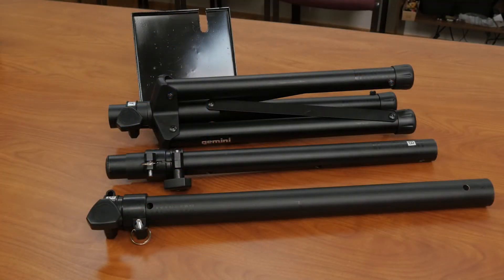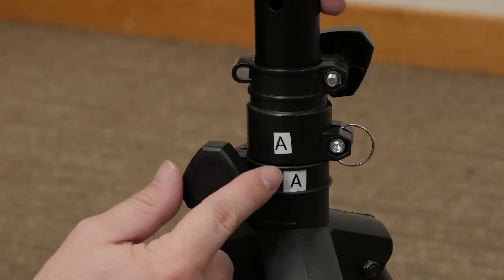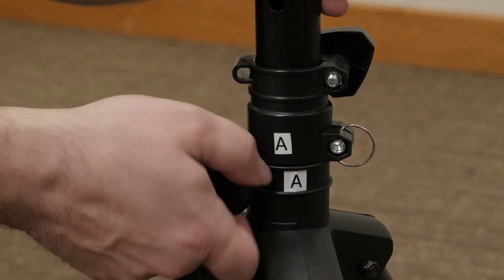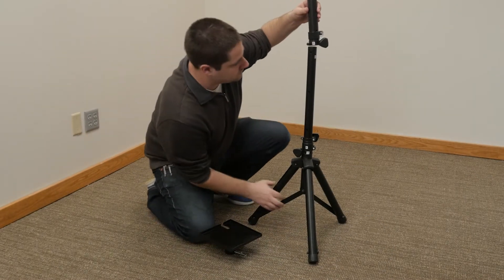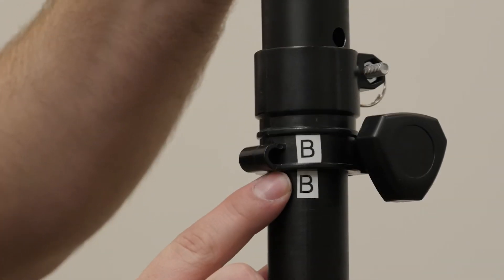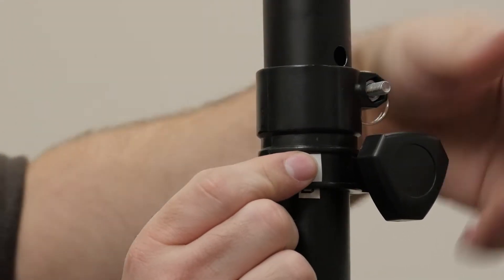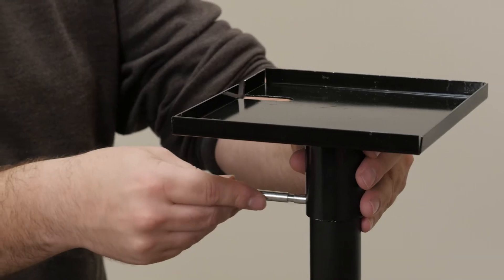The correct amount of tripods with trays, one for each sampling zone. To begin, in each sampling zone, set up the tripod by placing each tube in the coinciding part and tightening the turn screws. Place the tray on top and install the pin.